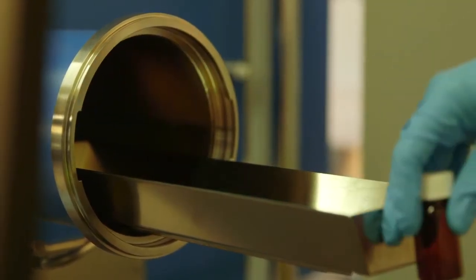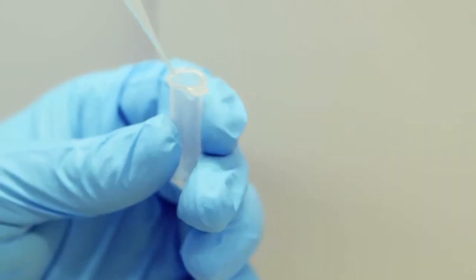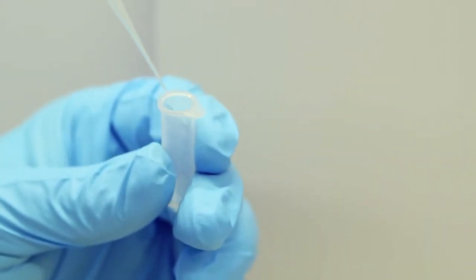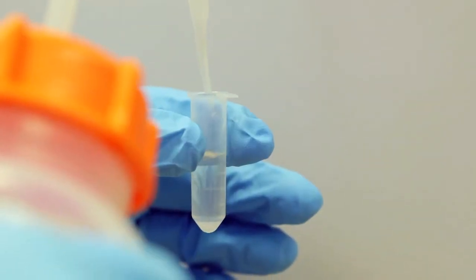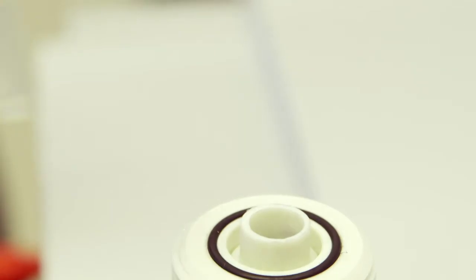Now we have to check whether the synthesized particles really have the desired features. The particles therefore need to be characterized. Various devices are available for this purpose.